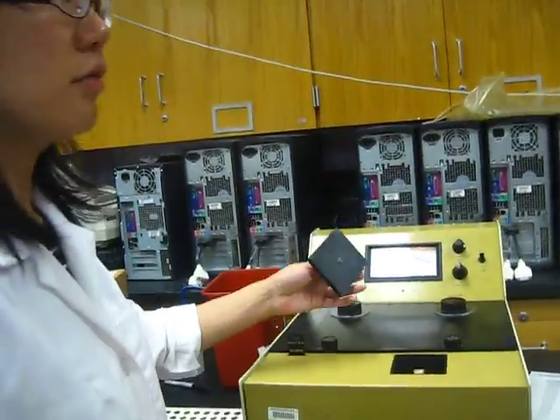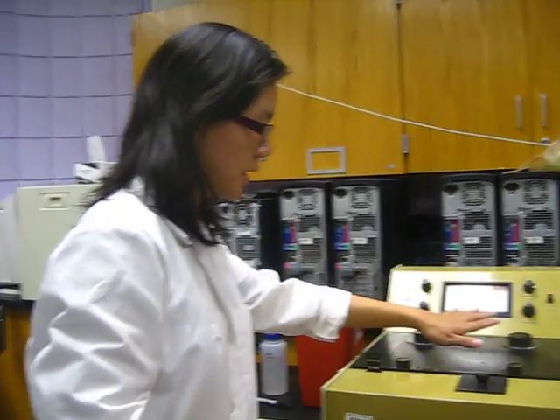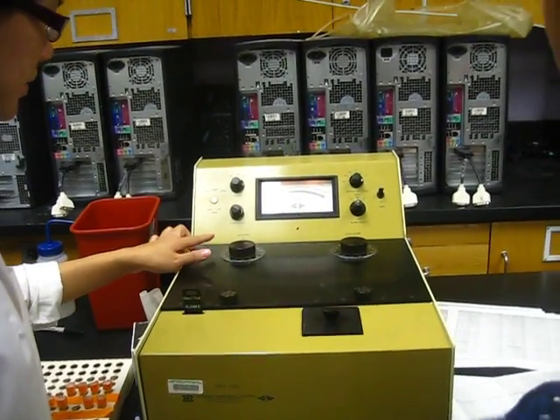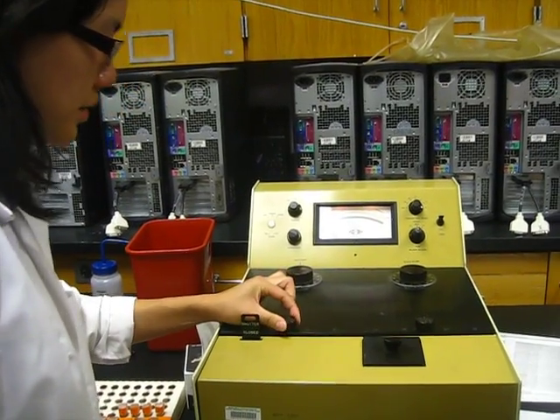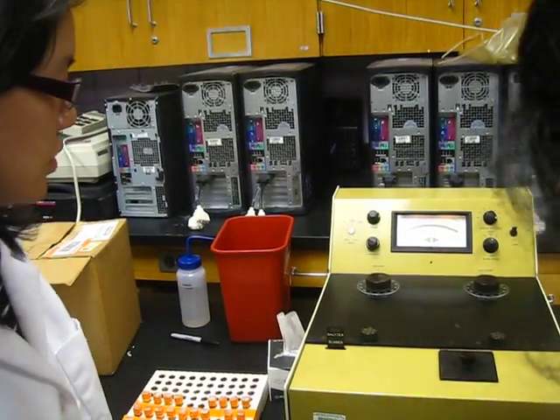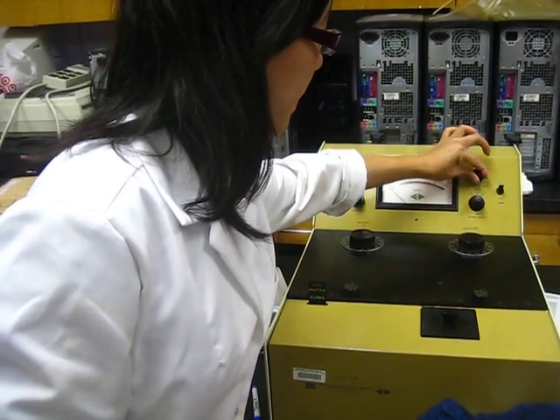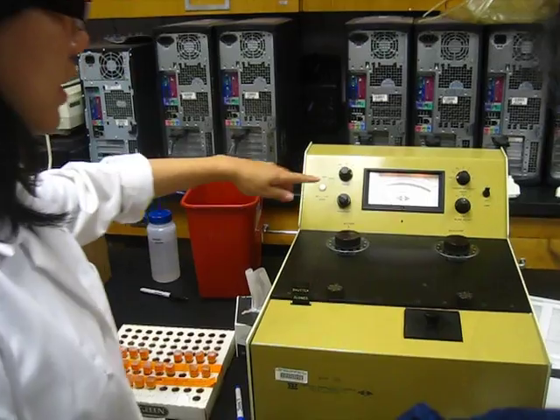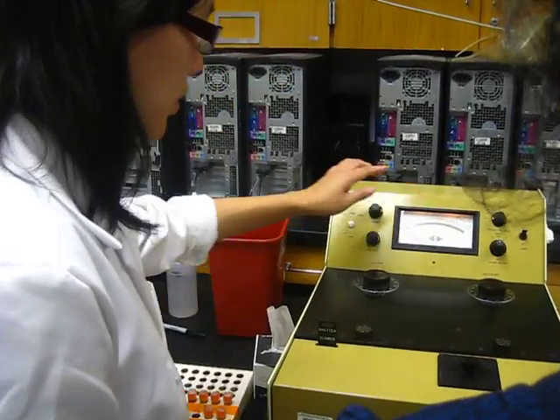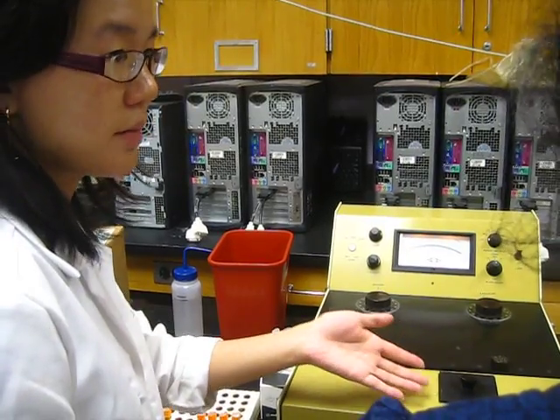Okay. Then we will close the lid and set up the excitation slit to 2 millimeter, and also set up the emission slit to 0.2 millimeter. And we will detect the maximum emission wavelength. For this, before we open the shutter, we'll make sure the percent full scale is 100, to be least sensitive, because we have no idea how strong the sample is.